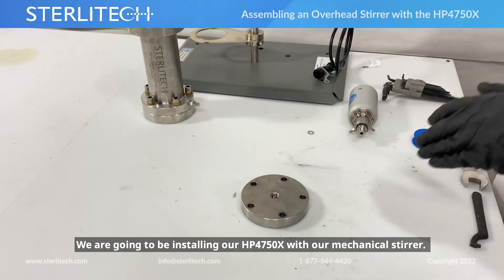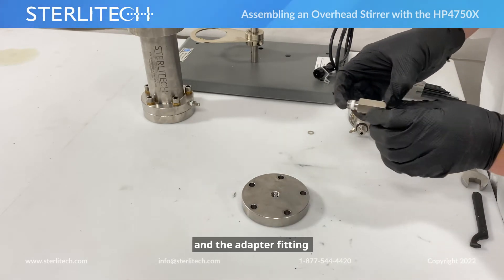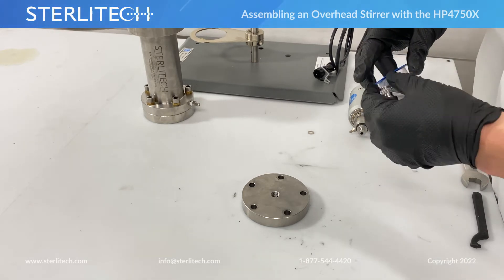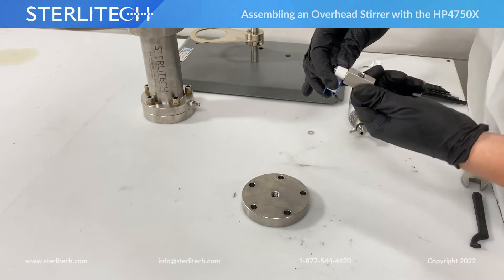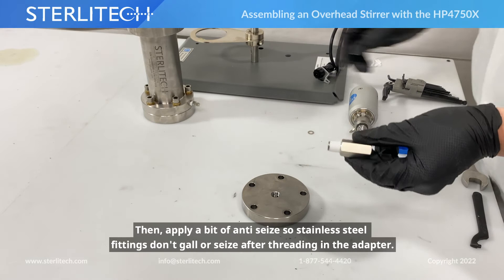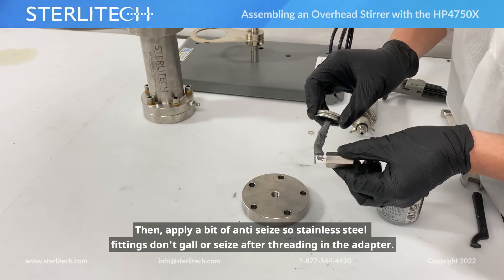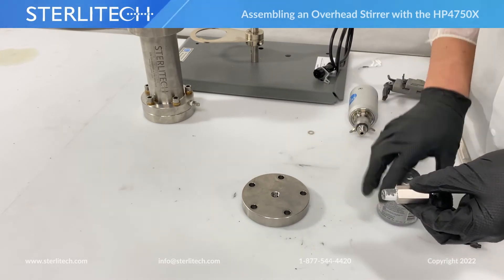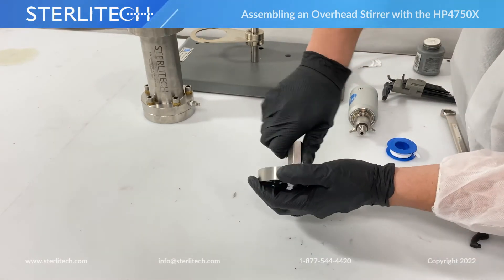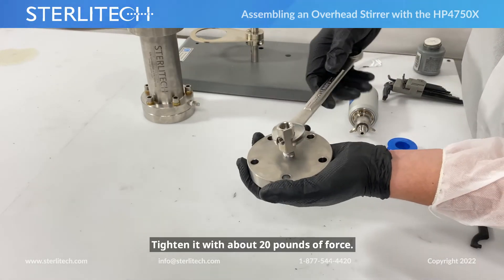We are going to be installing our HP4750X with our mechanical stirrer. We'll start with our cell top and we're going to need an adapter fitting. We'll start with four to five wraps of PTFE tape on the threads, and then apply a bit of anti-seize just so the stainless steel fittings don't gall or seize once you thread this in. We're going to thread it in by hand, and once we're hand tight, I'm using a three-quarter inch wrench to tighten it — about 20 pounds of force to snug it up.